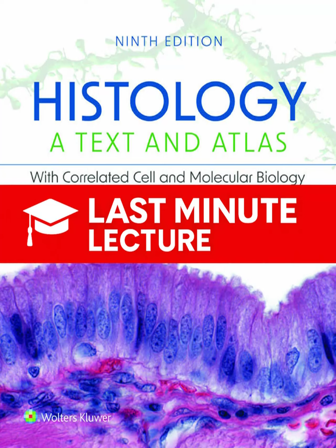So to prep the tissue for slicing, you have to replace all the water with something solid. Exactly. That's the embedding process. So after fixation, the specimen gets washed to get rid of all the extra fixative, and then it's dehydrated. How do you dehydrate it? You run it through a whole series of alcohol solutions, each one with a higher concentration, all the way up to 100% alcohol to get every last bit of water out.